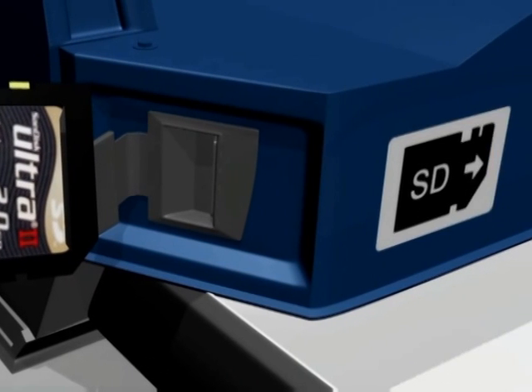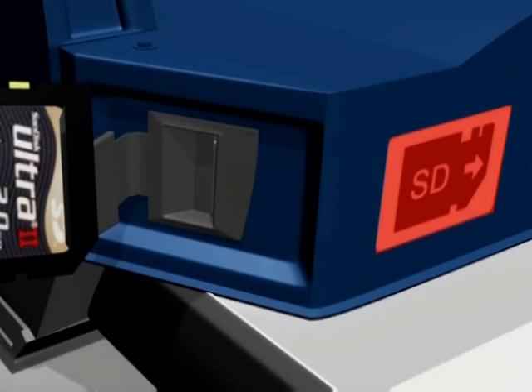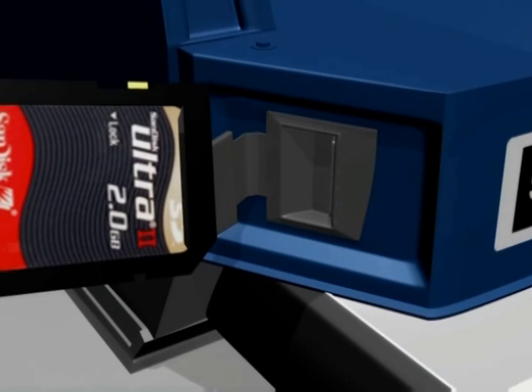When reinserting the card, there is a sticker on the front of the blue case showing the correct arrangement for insertion. Push the card in until it clicks.